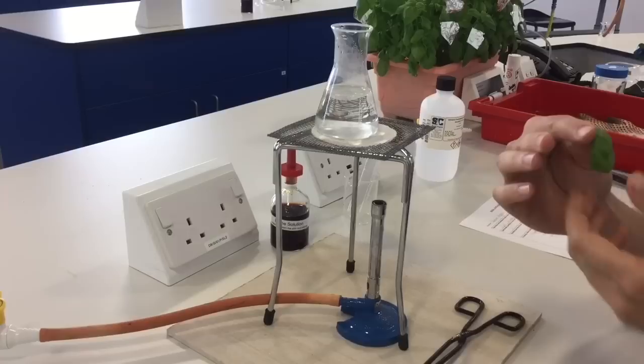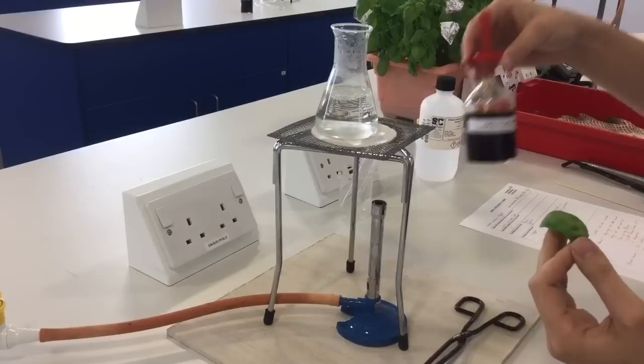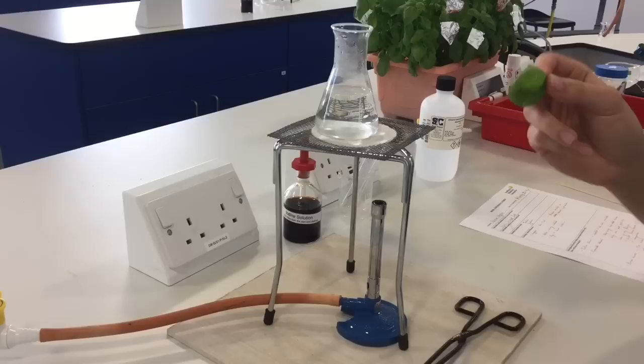The first thing we need to do is soften our leaf. The cells aren't very permeable, which means they don't allow a lot of the iodine solution to get in if you just put it on straight like this.